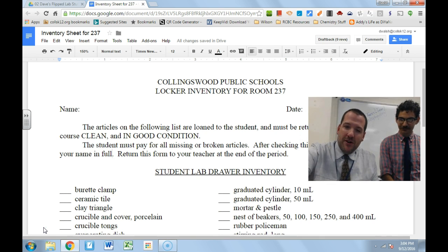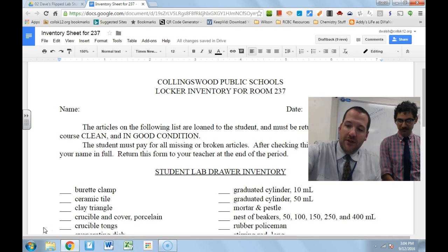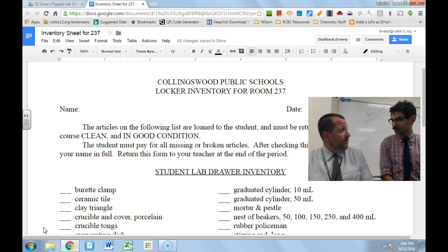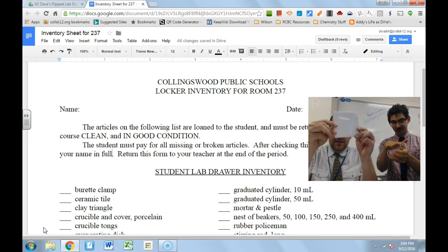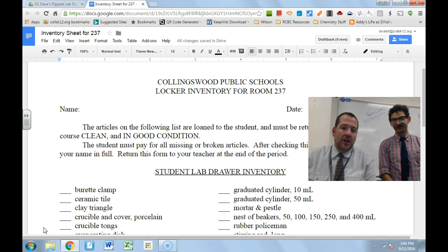One type of glassware is things actually made out of glass — so this is a flask. Then there are things made out of metal, like these forceps or tweezers. And then there are things made out of ceramics, like this ceramic tile. Typically at the very beginning of check-in, we'll clean the glass and the ceramic stuff. You don't have to clean the metal stuff, just so you know.